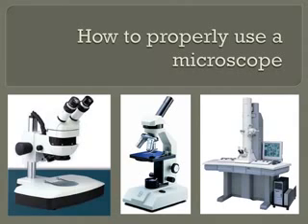This is one of a series of videos on cell biology. In this video, I will describe how to properly use a compound light microscope in a lab setting.